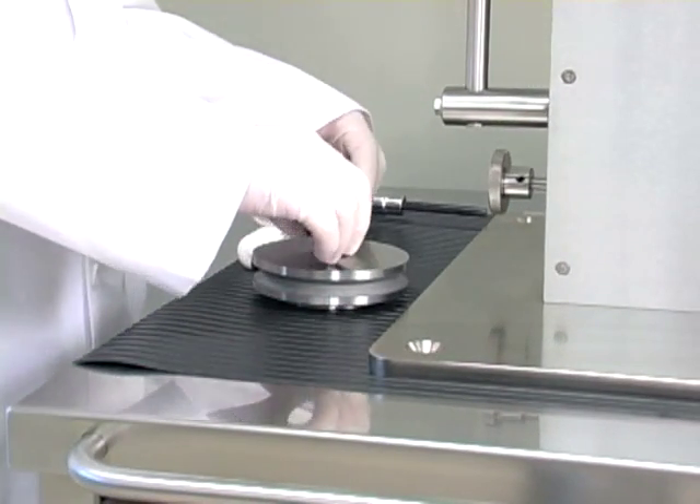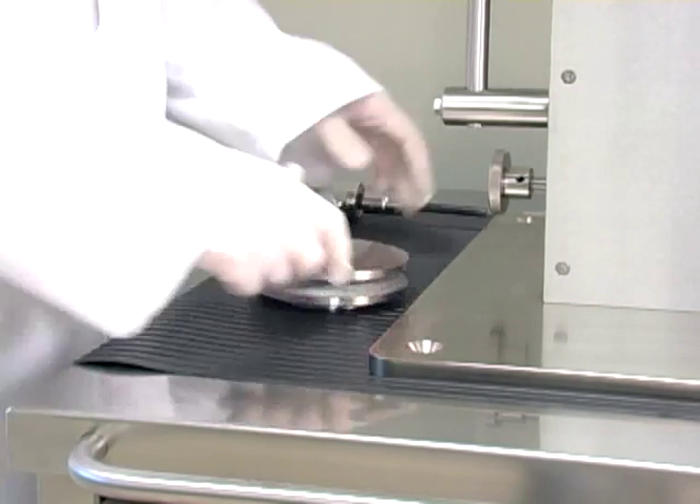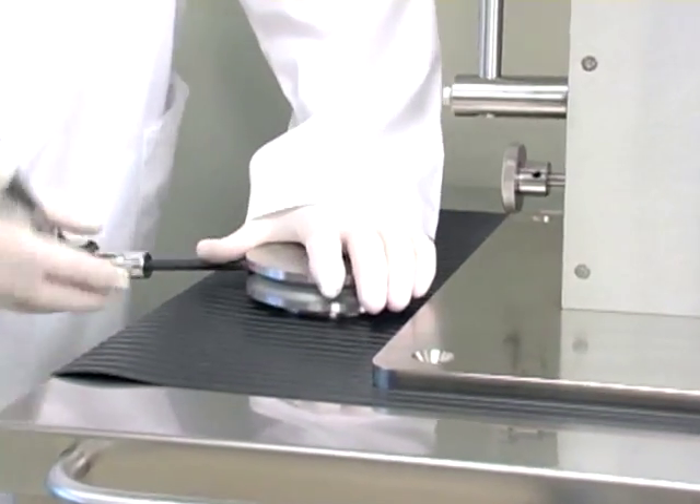Next we insert the die into the die holder. Once in, take the torque wrench and torque it down to 14 foot-pounds.